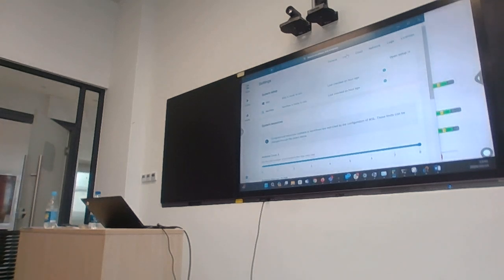Same message again. Yeah. So why? Because we did already reboot. So why do we need to reboot? Is the rebooting fixed? But I'll get back to that.